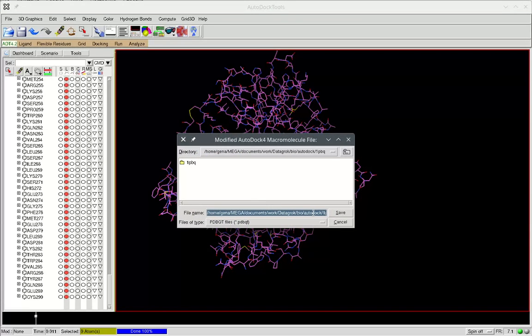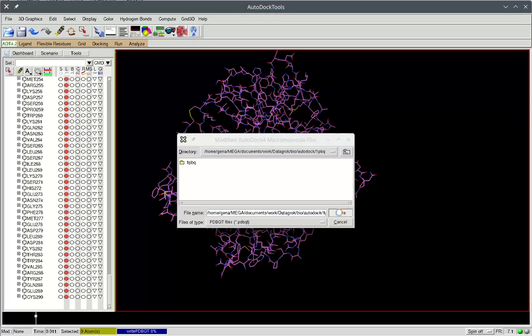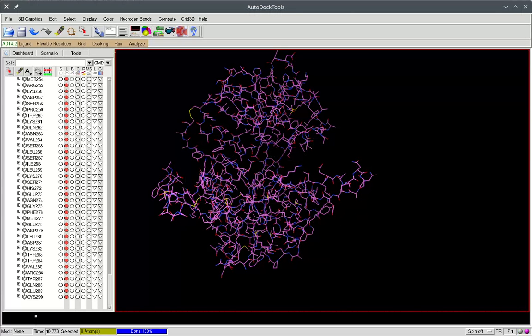Datagrok performs some pre-calculations and offers us to save this molecule in the PDBQT format. So we're saving the molecule.